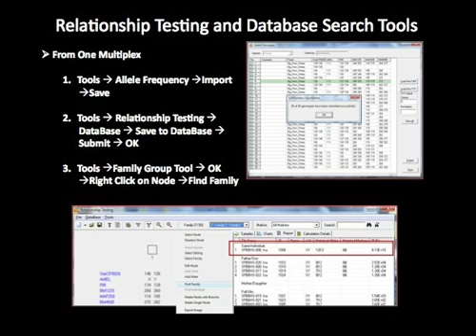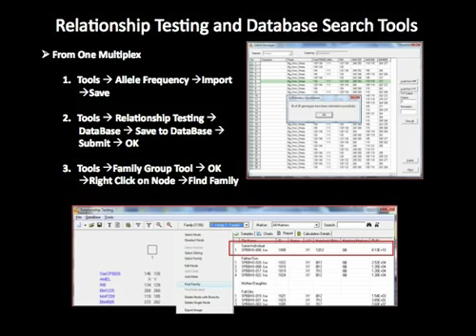If the animal markers did not include amelogenin, a gender marker, or they are from invertebrates or plants that do not have a single gender, there is a parameter to select to ignore gender. In these cases, the relationship level would be displayed as parent-child. Files with positive scores for full siblings and half siblings are also displayed in the table, which may be copied and pasted into existing reports or saved as an Excel sheet.